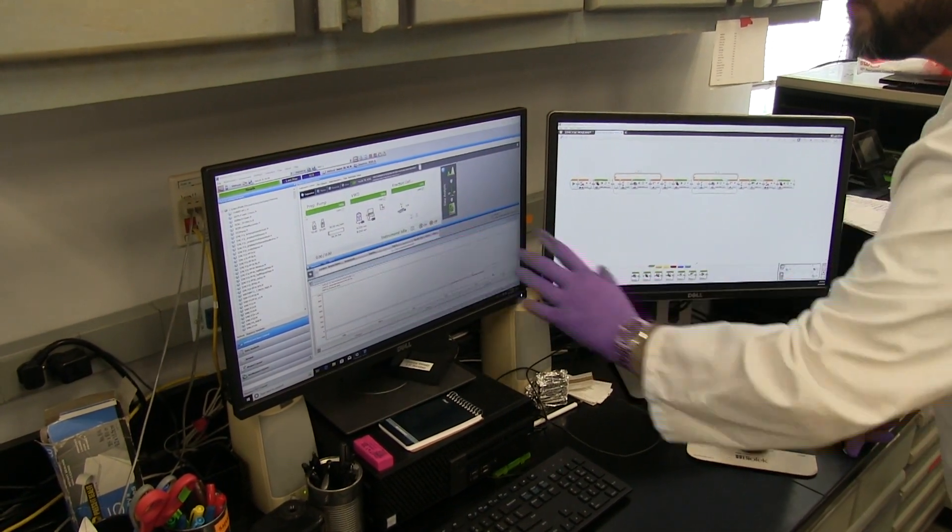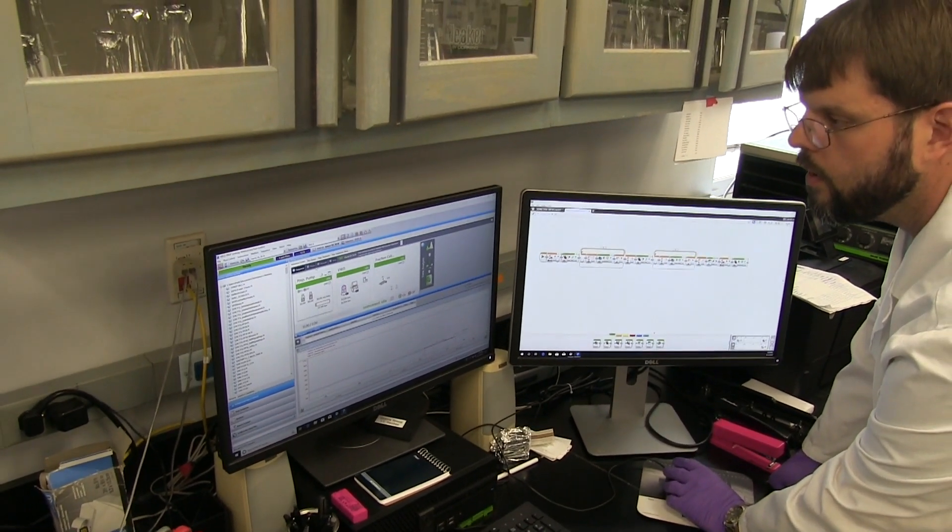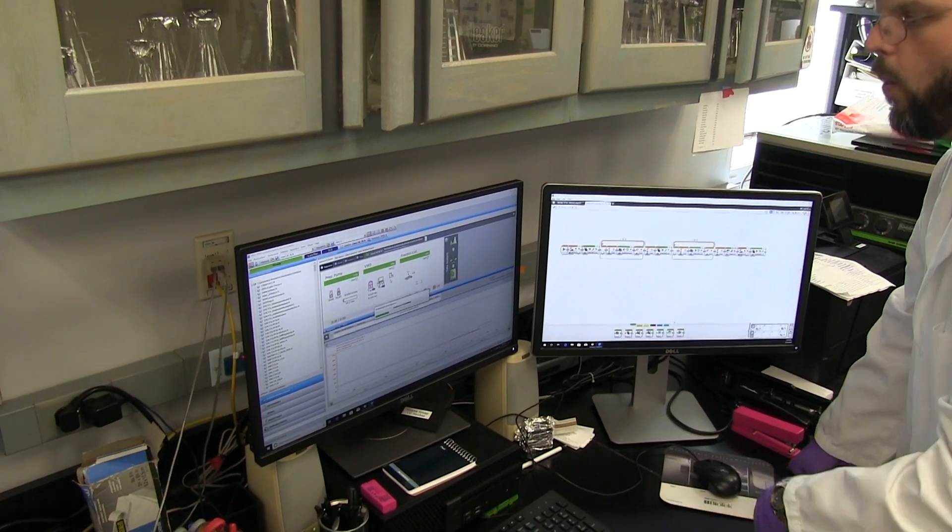It will now wait for a hard start on a button that we have affixed to the front of the HPLC. Next, we start the prep HPLC method just like a normal run and it will wait on a manual injection just like any other HPLC run.